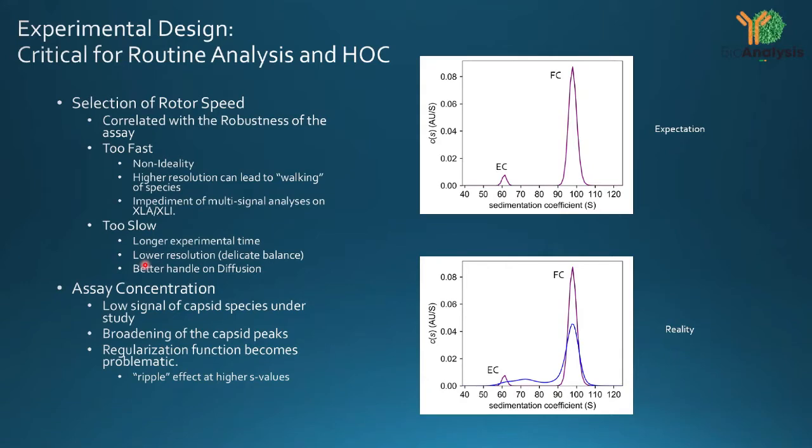Now, given all of this and this complete package, once you have figured out the best fitting parameters, the AUC experiment is so robust that those samples and those fitting parameters will always give you the same result. It is. And we have gotten percent CVs on quantitation less than 5%.